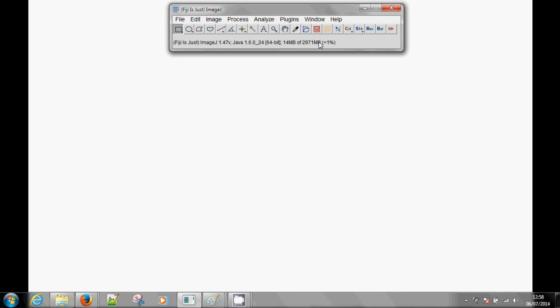Hello Fiji users, here's a short video to present you the toolbar I prepared for Fiji.